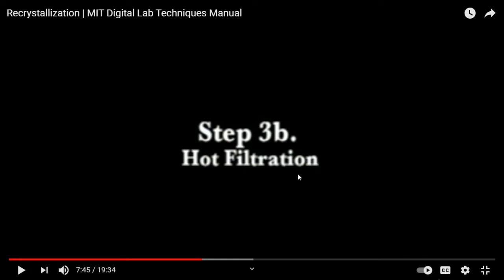Okay, so we are doing step 3, right? But this is optional, but because of the color we had, we need to do it. Stage A of the step 3 was decolorization. Now you have the decolored solution plus colored material on the surface of the charcoal, but the charcoal is considered an impurity, so you have to remove it. When you have a heterogeneous solution right now, liquid and solid, it's easy. Filter. We don't use a suction filtration or just a regular gravity filtration because we need to keep the solution hot.